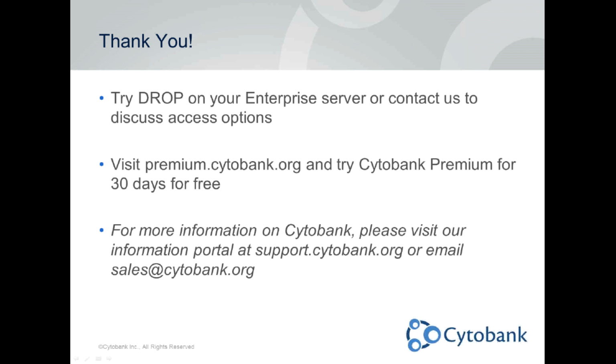How many rows do you need to run viSNE and get useful data? That's another very good question. In Cytobank, to run viSNE, if we're being technical about it, you need 3 times your perplexity.